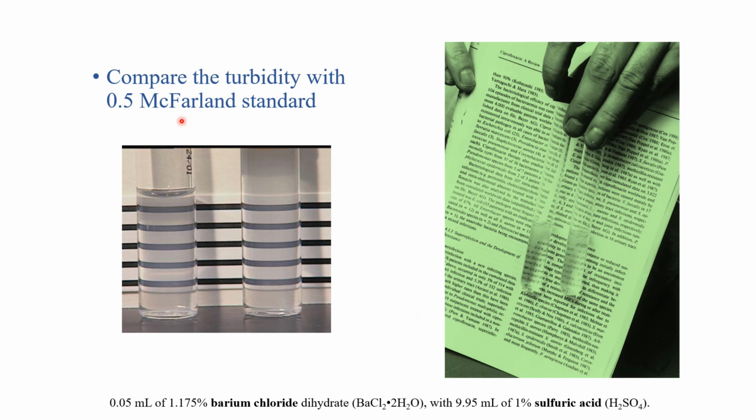After that, we will compare the inoculum with the 0.5 McFarland standard. So this is our inoculum, and this is the McFarland standard. This McFarland standard is a reference standard to compare the turbidity of the inoculum, so that our inoculum will be standardized by comparing the McFarland standard with our inoculum.